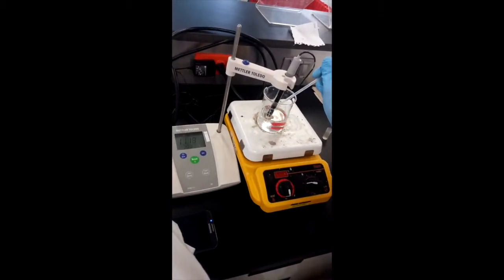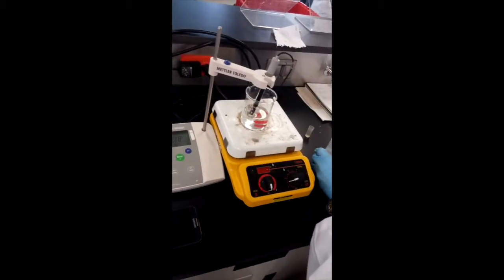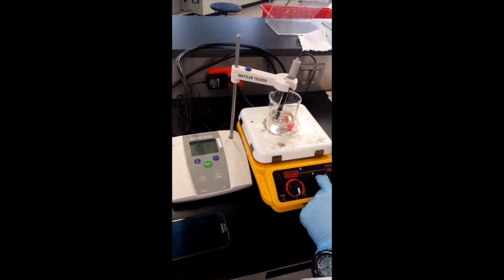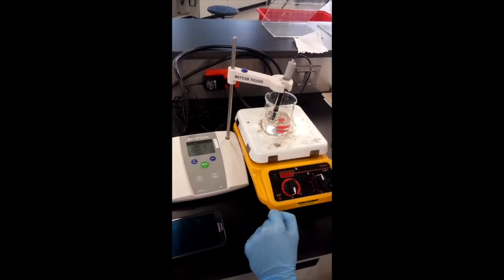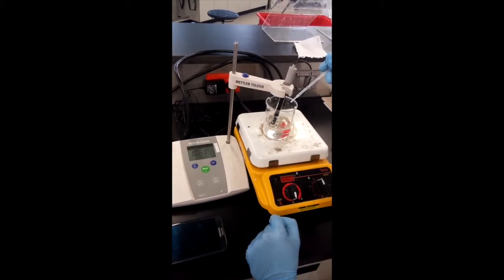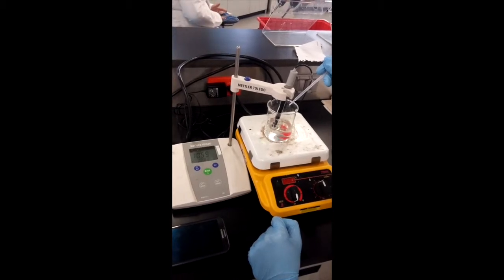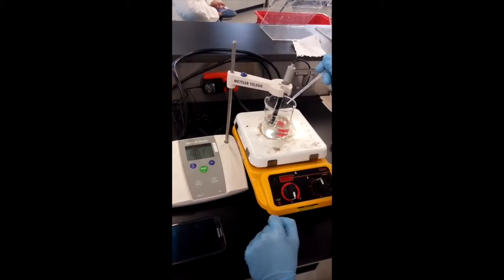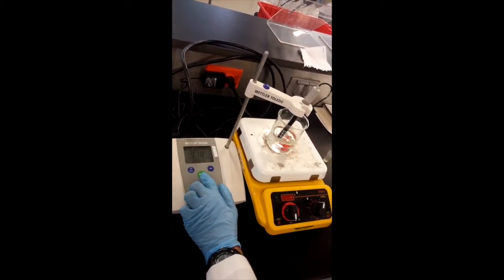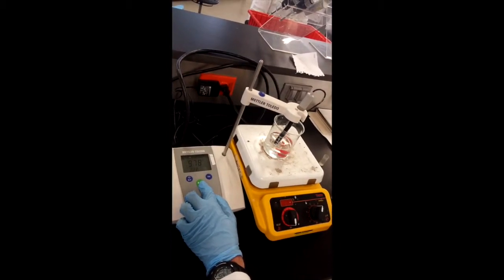Naturally, poorly prepared solutions can cause a great amount of consequences. Firstly, they will negatively affect every procedure in which they are used, because many of these require very specific conditions or concentrations. When the solution is not labeled, it has the potential to cause confusion in the user if he doesn't know what he is using, which at the same time can cause other problems like, once again, non-desired effects in an experiment. If the solution is dangerous in any way, like being explosive or toxic, not knowing what it is can cause damage to the health of the user, because the user will not know how to manipulate said solution and what special measures it requires.